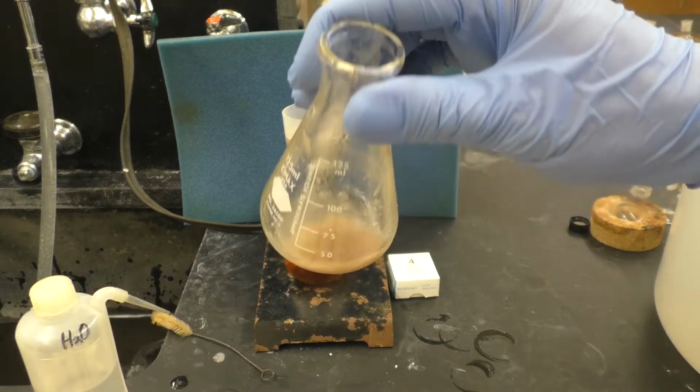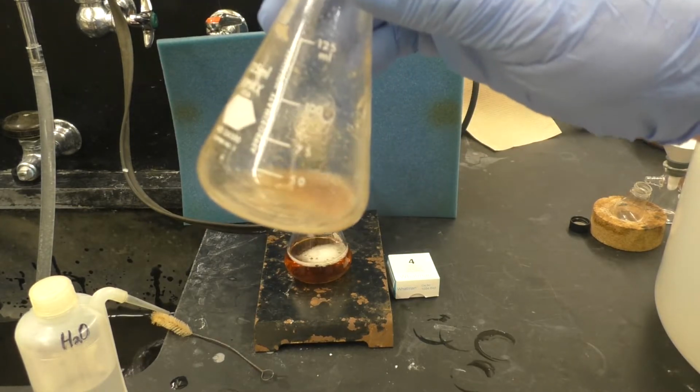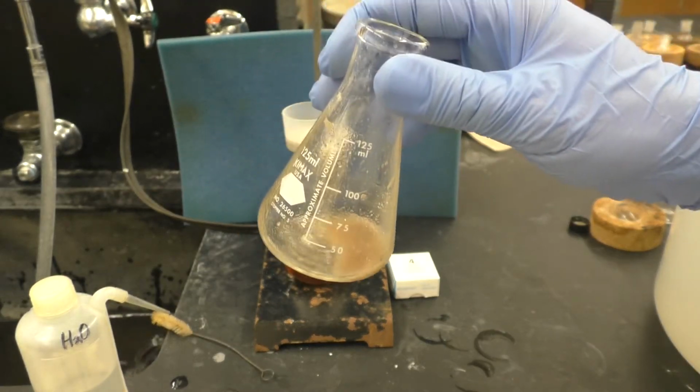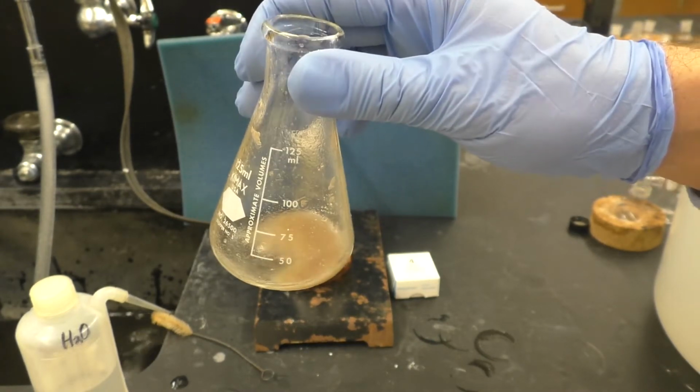You may notice a few white chunks here at the bottom. That looks like undissolved sodium carbonate. So before I put that onto the filter, I'm just going to add some more distilled water, and I'll rinse the whole system with distilled water.